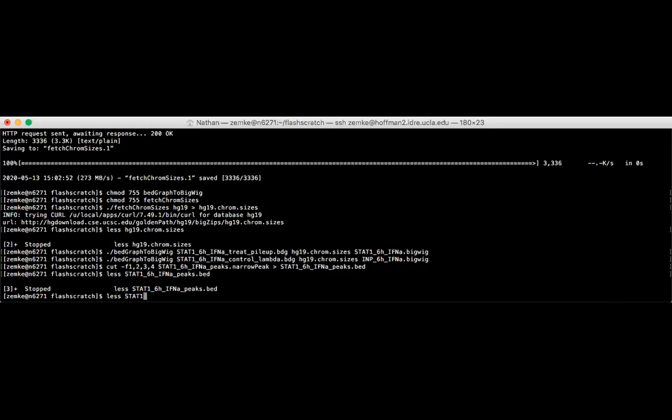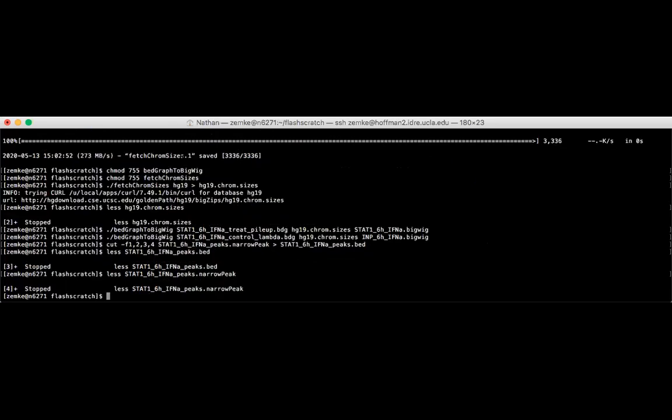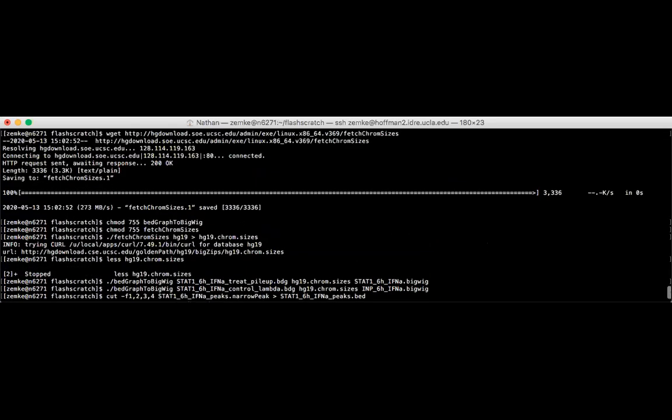So in the file that we used to generate this, like this, so we remove some of these lines. I can't remember what all these columns mean, but if we opened up the Excel file, I don't know if it'll look right on this, but the Excel file will have more information about what each column means.